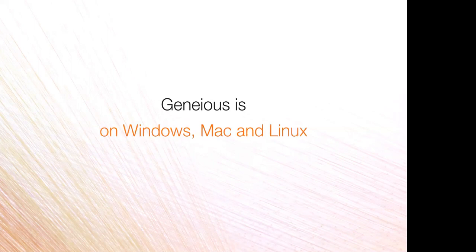Geneious does run on Windows, Mac, and Linux. The license is valid for all of those operating systems, so you can use whichever operating system you work with.